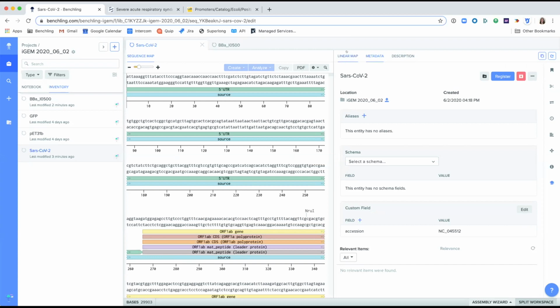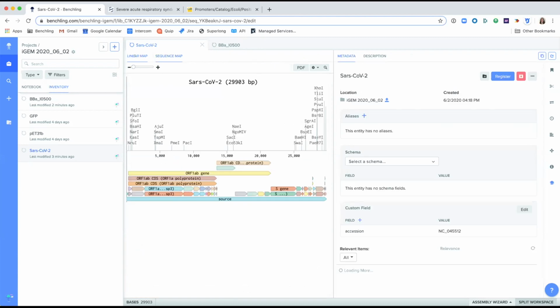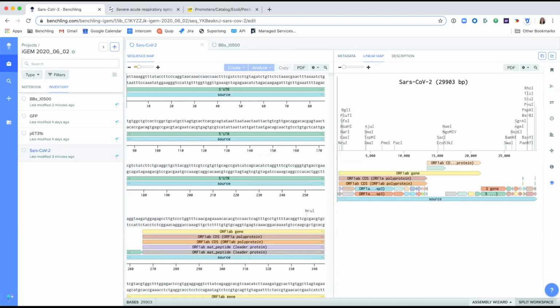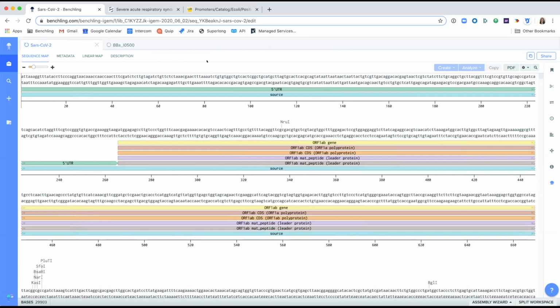These tabs can also be moved around, in order to maximize your real estate, as we call it. So right now, I'm going to unsplit my workspace so everyone's able to see my SARS-CoV-2 sequence. And actually, another hidden trick for Benchling is to collapse this projects menu. I'm going to re-click on the briefcase to really maximize that real estate.